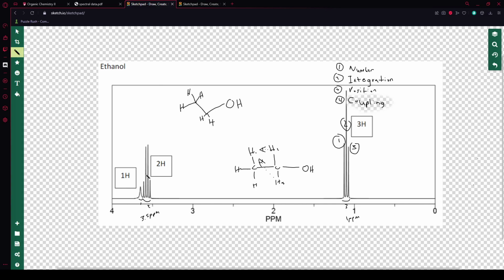And then the second group of peaks, there's one, so we do have hydrogens, and they're attached to 1, 2, 3 other hydrogens, and so that's our hydrogens here. So we'll call this H1, and they see 1, 2, and 3, and they see 3 hydrogens. So that's why there's 4 peaks. So hopefully that makes sense.